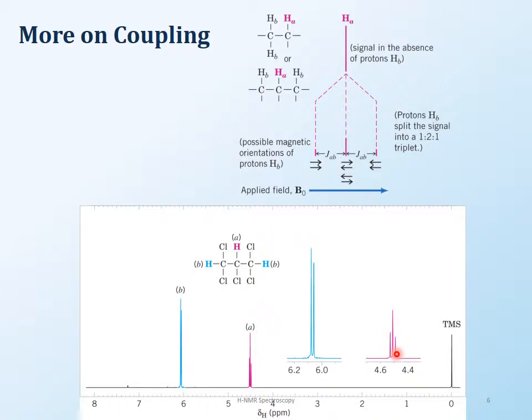1:2:1. It's a very symmetrical kind of a thing. Okay, it's very pretty, it's beautiful, very symmetrical and very logical. Whereas the alignment over here for a doublet is going to be just about 1:1 because you can have either that 1 proton facing the magnetic field or it could be opposing the magnetic field. So you only have 1 alignment on either side, which means that you have 1:1 ratio, which means that the doublet is then equal.